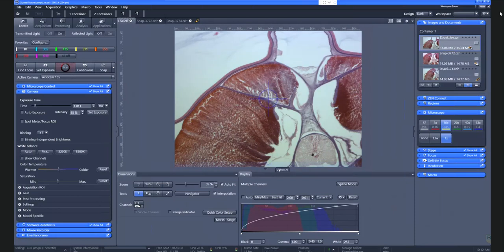So we do not change any values of your image. Okay, and color camera mostly refers to a gamma which is below 1.0 to make sure the contrast of the image we're looking at is pretty much the same as what we would see using the eyepieces and using the microscope. This has to do with the settings of our displays.